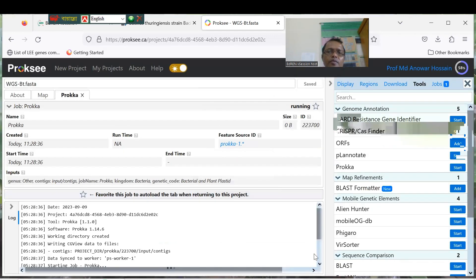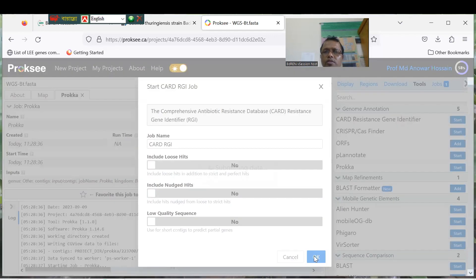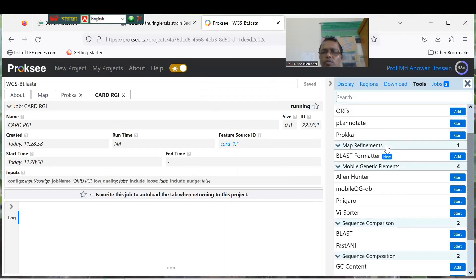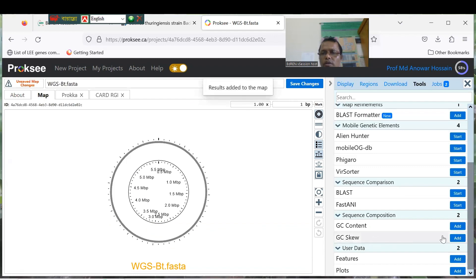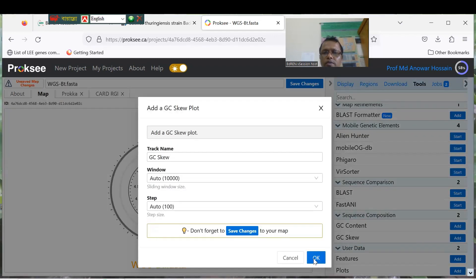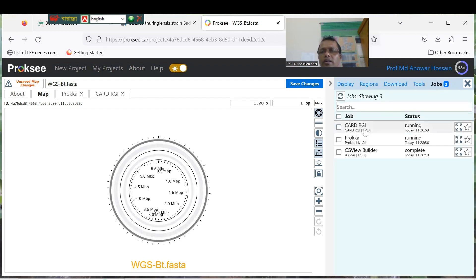Prokka is working. You can also use the CRISPR Finder and the CARD Resistance Gene Identifier — this one identifies antibiotic resistance genes. You can use this as well. You can also add GC content and GC skew to the map. The map is already being updated. CARD RGI is running, and the analysis is also running. We have to wait a little time for the work to complete.